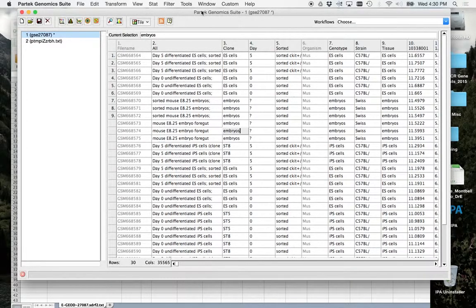This is the big test, right? I've got all this information in. What do you think is the first thing I want to know? Yeah, all right. Well, when I see what it looks like, what does that mean? Like, what am I looking for? Well, basically, the first thing I want to do is figure out if it's worth analyzing.